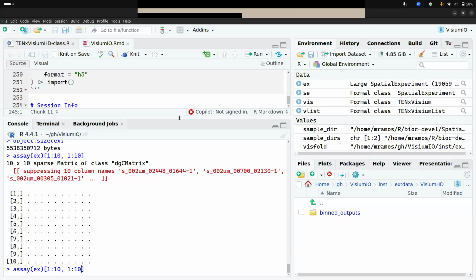So I just put the first 10, there's nothing in there. I know you're not looking for more things to do, but if you ever have time, I think it would be really useful to have a data package for the HD, like the 10X Visium data package, a collection of the publicly available data sets, even with just one example, this one you already downloaded.